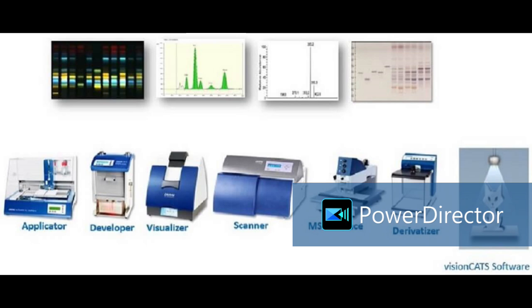Pesticides, any drug like alprazolam, diazepam, in a suicidal case, if it is detected in the visceral samples, then if it is present and detected in your sample, you can match the spectra of that particular poison or cause of death analyte. You can take the spectra of that and match with the library. We have a library of spectra in our software, so from the unknown also you can find out exactly which drug it is matching, alprazolam, diazepam, the cause of death you can find out. Okay. We can measure the area manually or automatically?